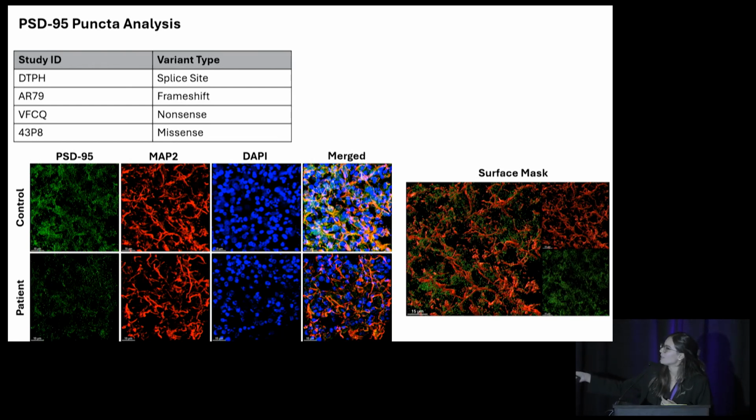So basically what we do is that we get these thin slices of the organoids. We have the protein PSD95 expressed throughout that slice. And then we add an antibody that is specific to PSD95, and then we add another antibody that will glow in a specific color. And then we can see that. So in green here, that's PSD95.